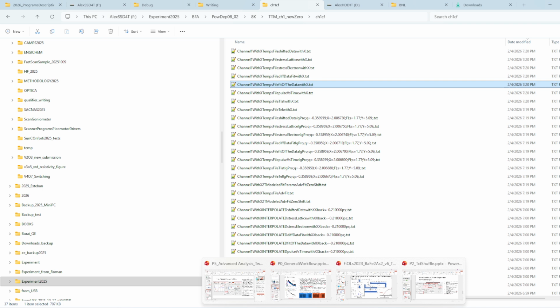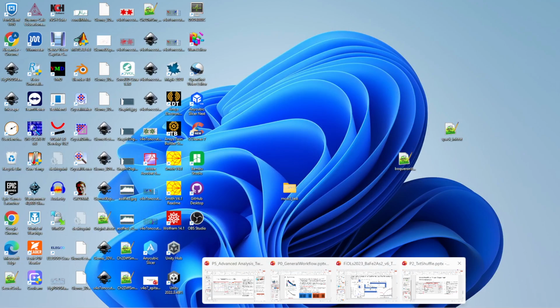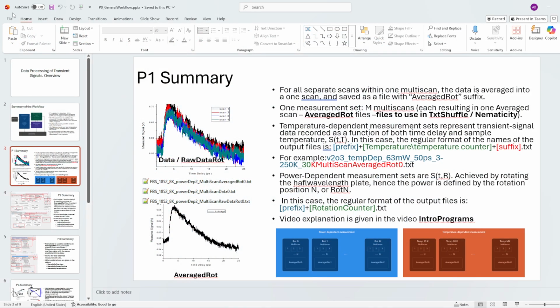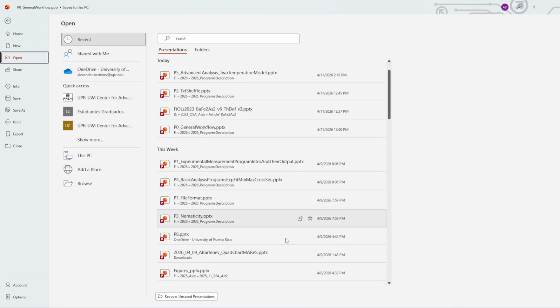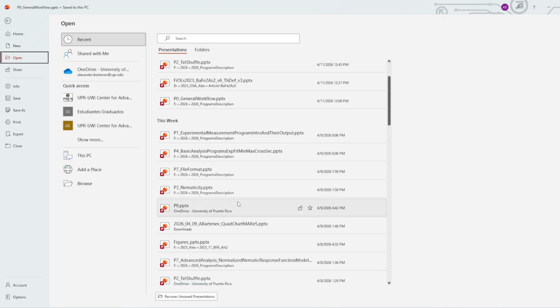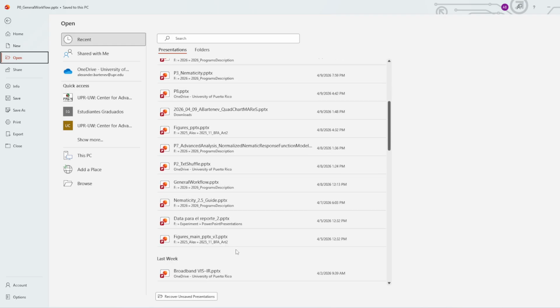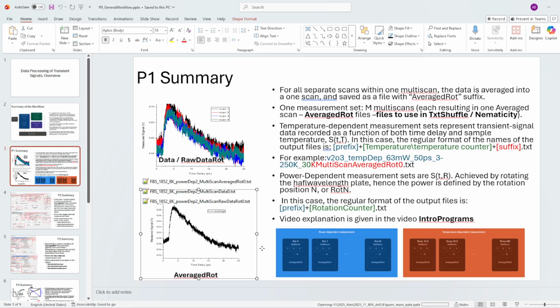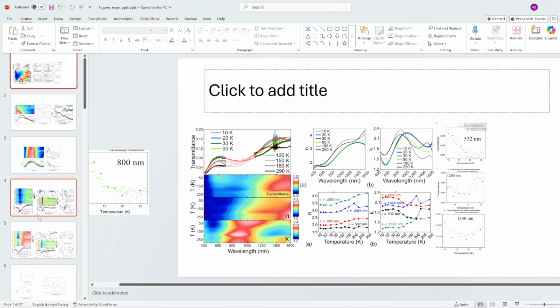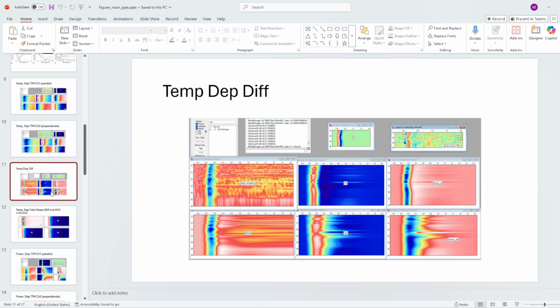Additionally, I probably can open, based on the previous models, the already plotted in IgorPro all of those files, and in more details how to plot in IgorPro you can find in the presentation number 7 and corresponding video. Here I will just go through the files.